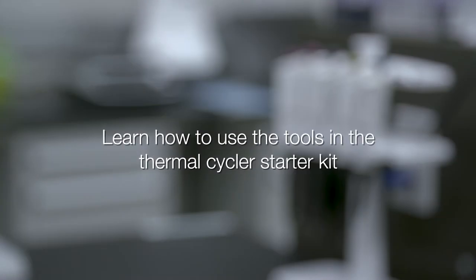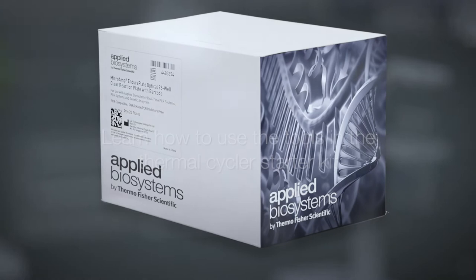In this video we'll discuss how to use each accessory and tool that comes with the purchase of a new Applied Biosystems Thermal Cycler.